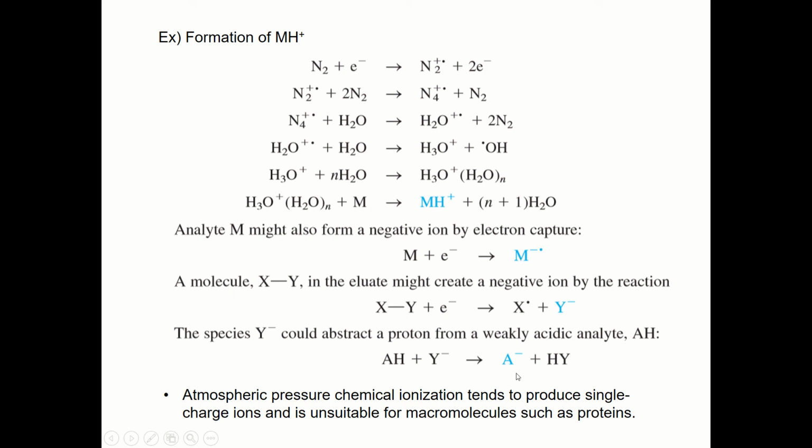It is unsuitable for macromolecules such as proteins because protein molecular mass is really high, and when these molecular ions are singly charged, the mass to charge ratio becomes very high.